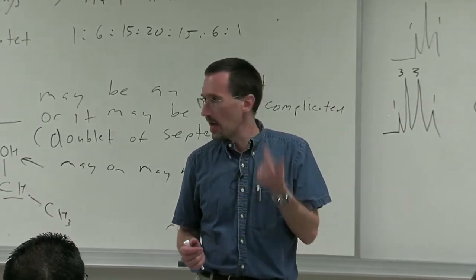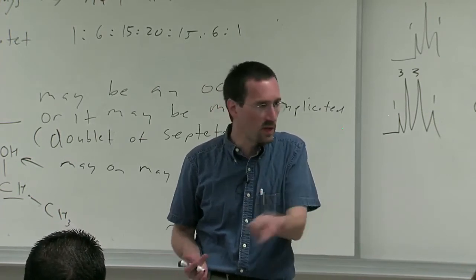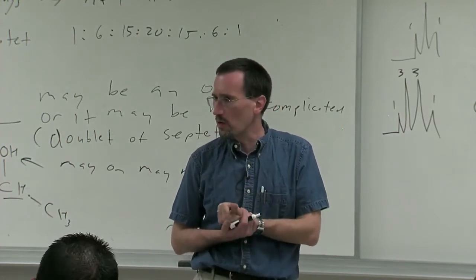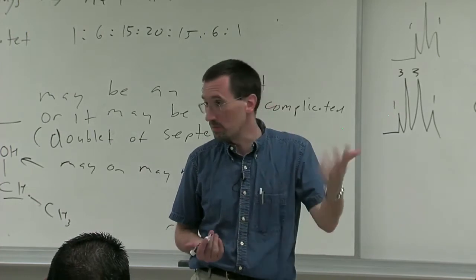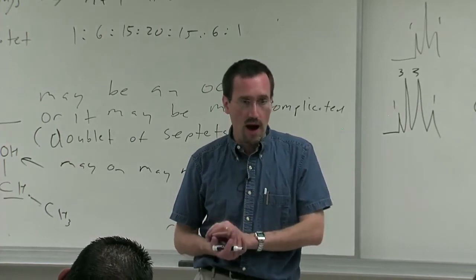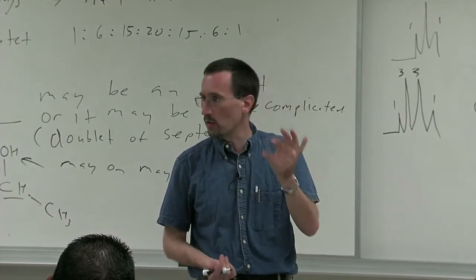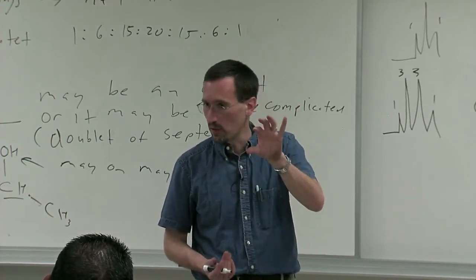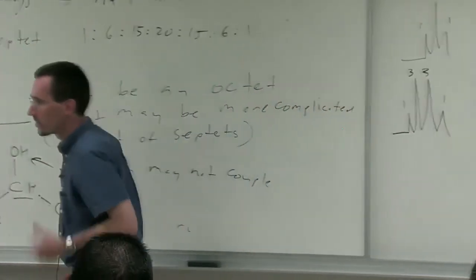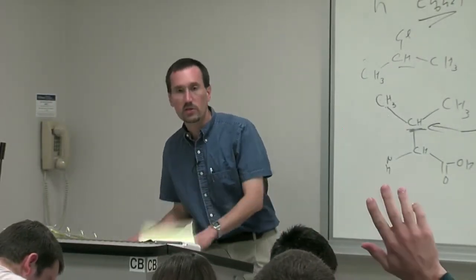There's invariably adventitious water in your NMR tube at about 10, 20, 30 millimolar concentration. And chloroform undergoes photooxidation to give hydrochloric acid, or DCl in the case of CDCl3, and that will rapidly promote exchange. So if I want to minimize exchange, I typically will pass my chloroform, not my sample, but my chloroform, through alumina that I've dried over a flame. That'll take out the acid and minimize the amount of water in there. Okay, so alcohols are kind of a wild card on J coupling.